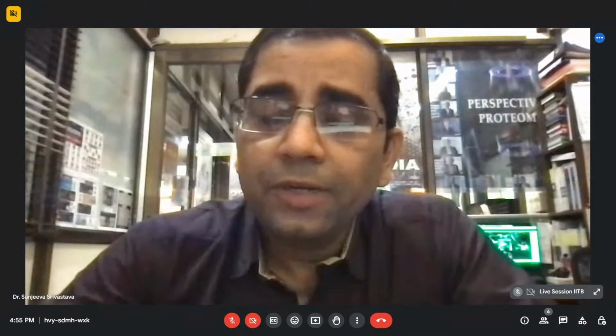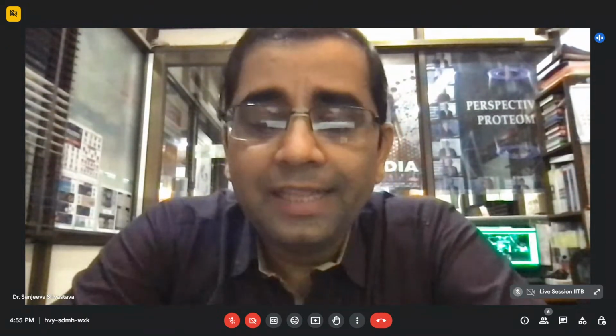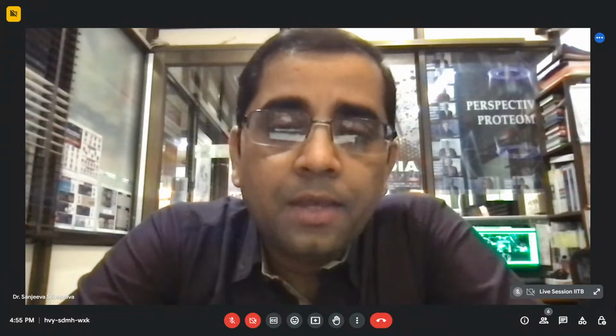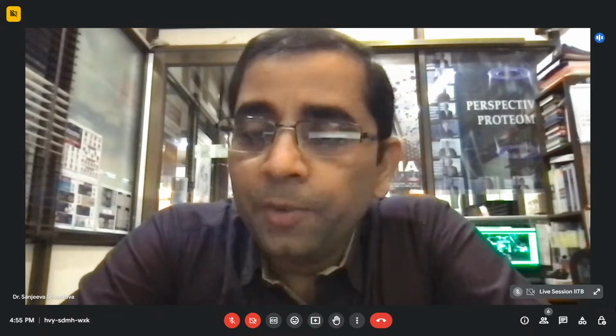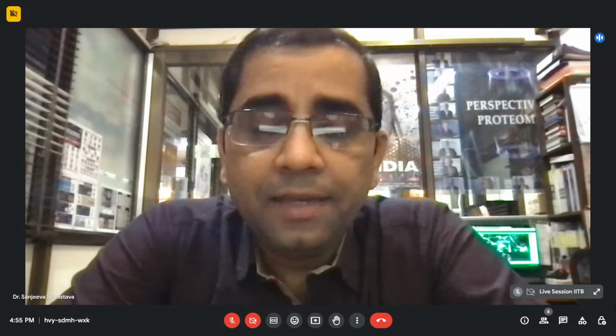All right, thank you, Ankit. What the students will appreciate is that the same technology platform of LC-MS/MS which we are talking about can be utilized for global proteomics or even global metabolomics as well. But now let's say you have identified hundreds of leads coming up as proteins or metabolites, how do you validate them? Validation therefore becomes quite challenging and important.